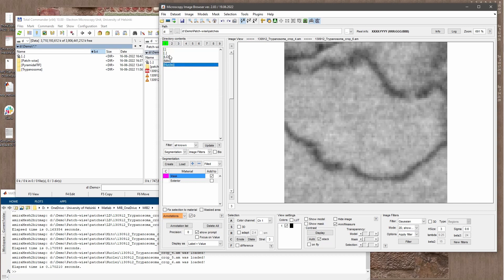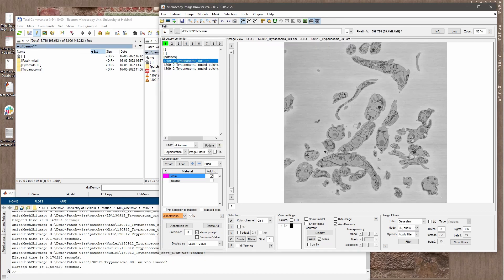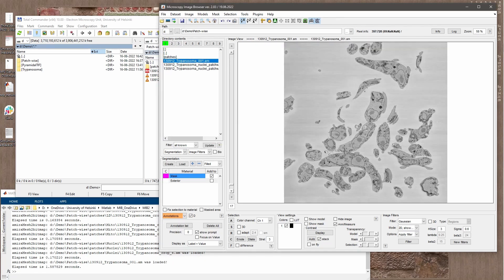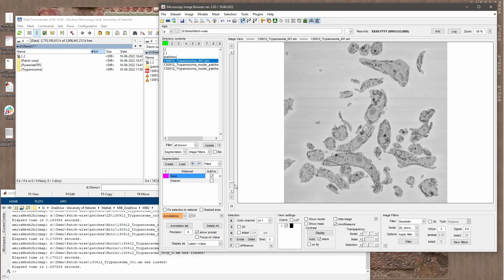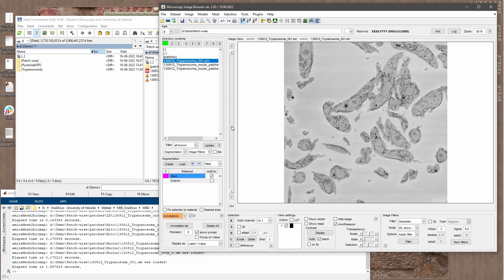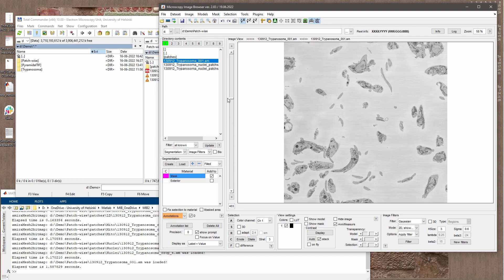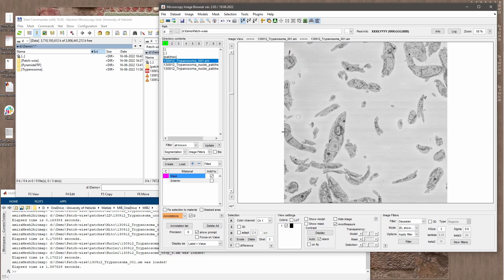In our case today we have a dataset of Trypanosoma brucei taken with serial block-face scanning electron microscopy, and what I would like to do is identify locations of nuclei in this dataset.